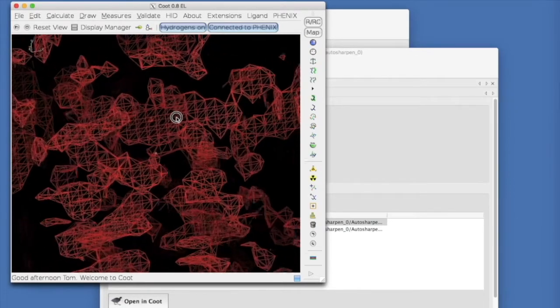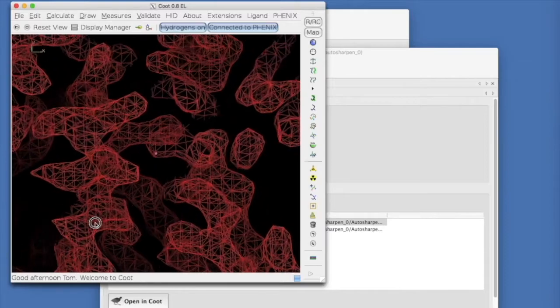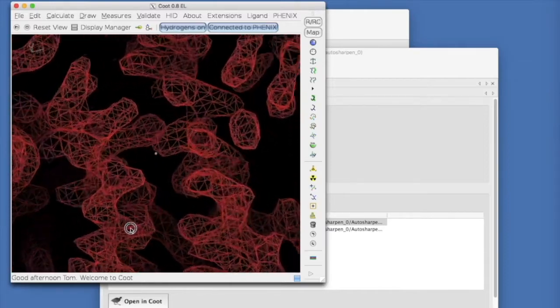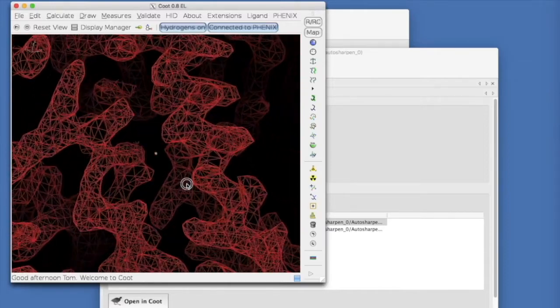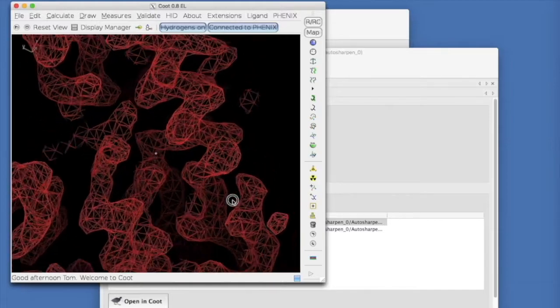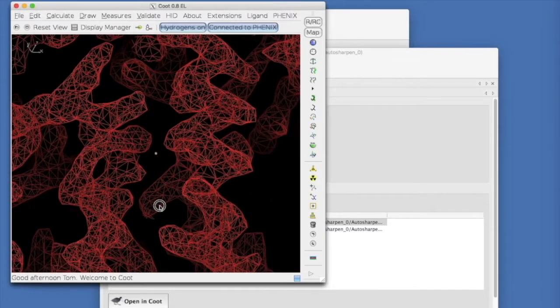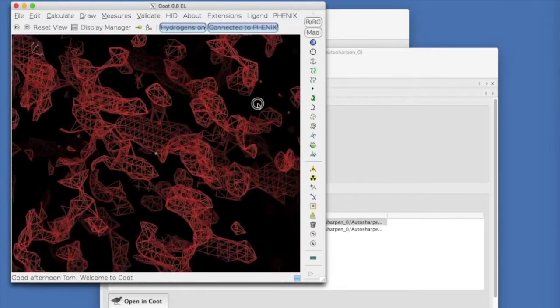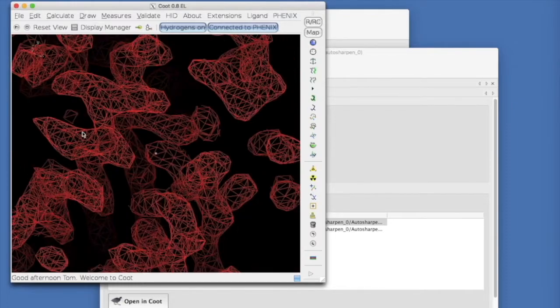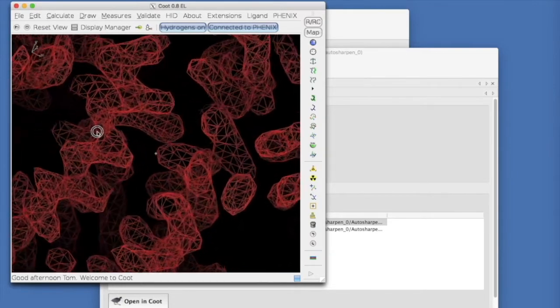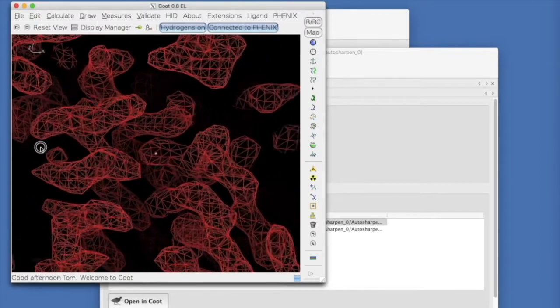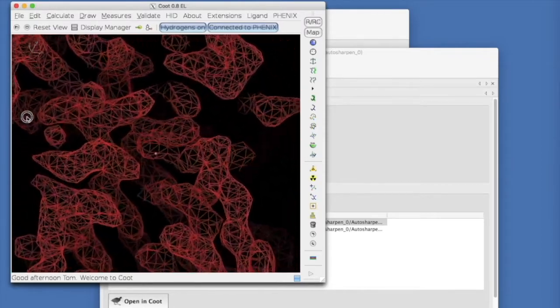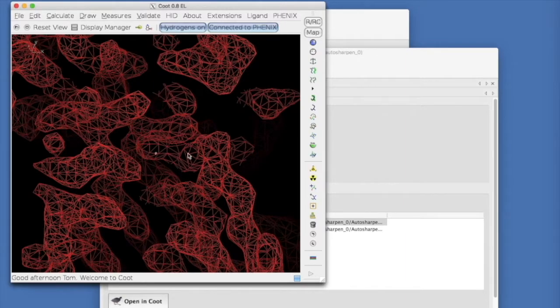However, note that these two maps have exactly the same information in them. It is just that the weighting of Fourier terms at high resolution is different in the two maps. The over sharpened map has large Fourier coefficients at high resolution and the optimally sharpened map has lower values. In this case, it was necessary to blur the map to optimize it. In other cases, it is necessary to sharpen it.